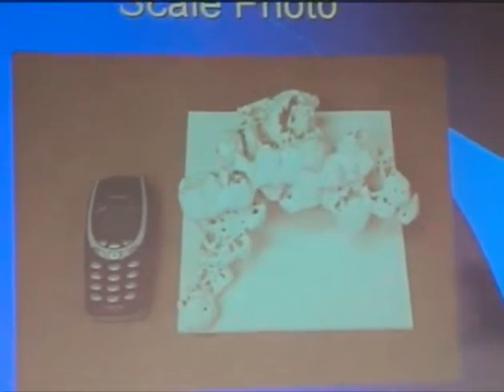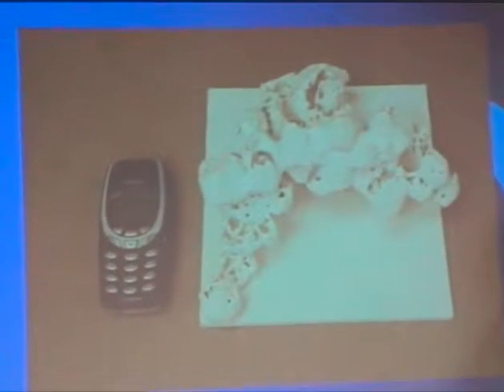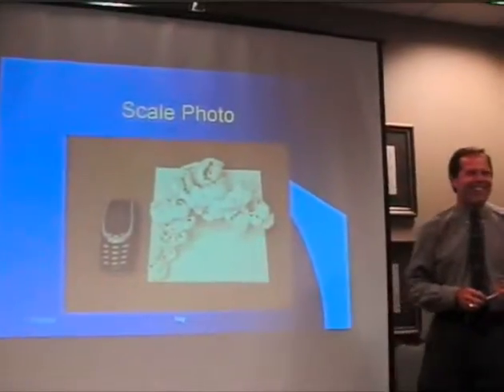There's my cell phone. So that's how big we made it. The other thing that could be done is to, in some of this 3D visualization, put on one of these little hats and then put this in a room and walk around, and then you could walk around inside the catalyst particle and look for your catalyst, see if any's where you think it is, right? That's the next thing we'd like to do, because we do have a visualization center on campus, but I thought this might be a little bit more realistic, and we could start to hold this in our hands.